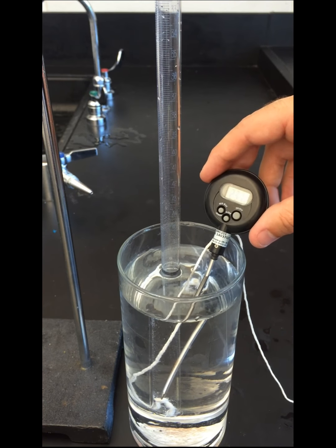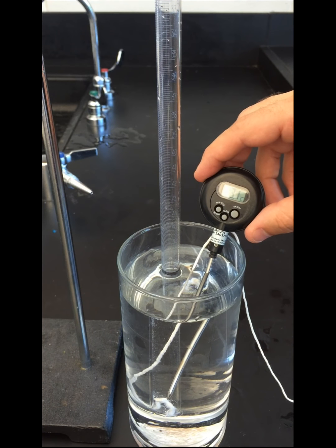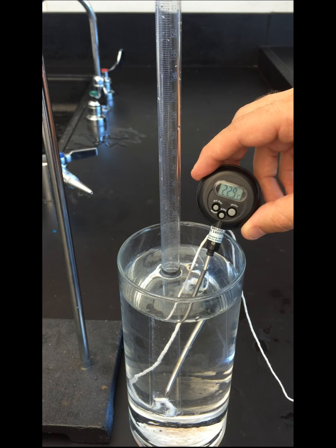At this point, we've only collected the volume. We'll also need to know the temperature of the gas, which we can assume should be roughly the same as the temperature of the water. We'll also need to know the pressure of the gas inside the tube. We can use the room pressure in order to figure that out.